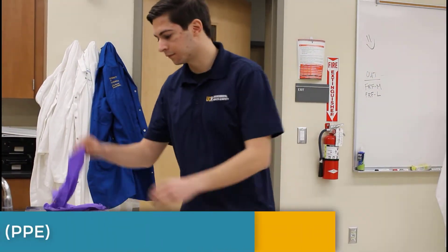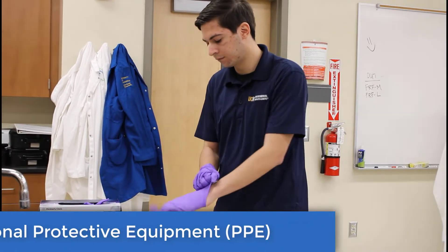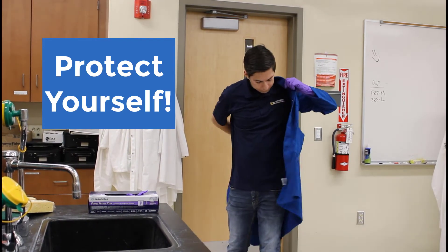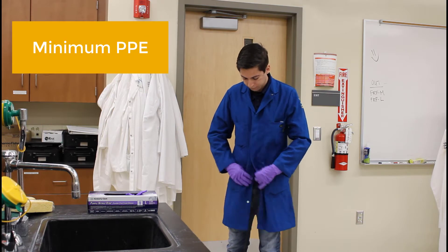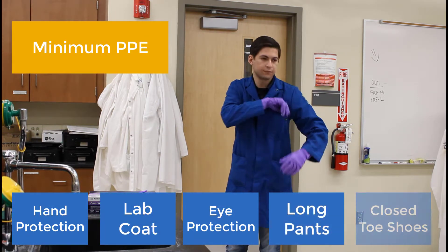You should always wear personal protective equipment, or PPE, when handling hazardous materials. Many injuries occur due to the lack of proper PPE, so be sure to protect yourself. Minimum PPE consists of hand protection, lab coat, eye protection, long pants, and closed-toed shoes.